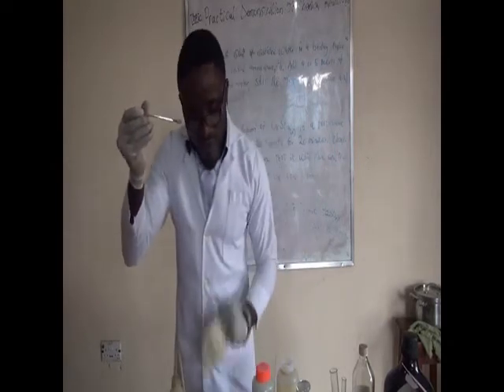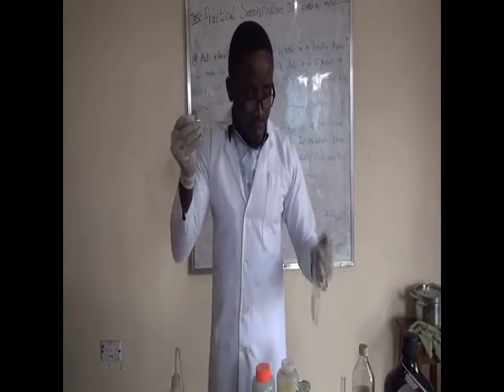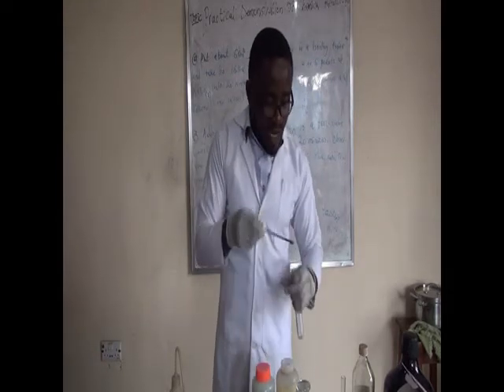So if I have to drop this in this water, I'll drop it, then observe what is happening. Try to stir.